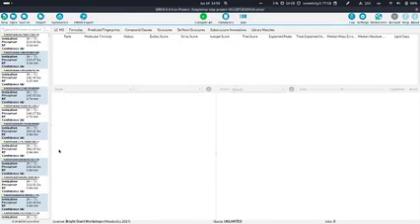Okay. So now, I hope for everybody who's following along, there should now be something on the left side. On the left side, this is the compound list. Maybe for all the people who have used SIRIUS 5 and other SIRIUS versions, it has changed now a little bit because we are using these mzML files. There are now some names which have just been generated during the import. So these names will also, I think, be different when I later load in the pre-computed project space.